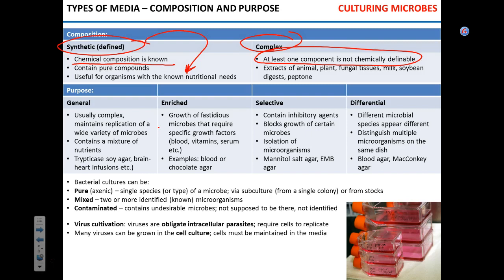You might ask, wait a minute, but complex media is so much easier to work with. It definitely will provide nutrients for the microorganism, right? Turns out, the defined or synthetic medium gives you a pretty neat tool to figure out what are the roles for different chemicals in the growth of a particular microbe.